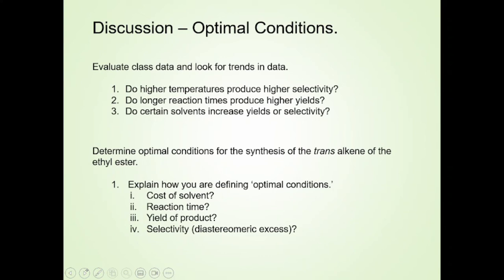about reaction times. Who had 15 minutes for a reaction time? You did. Were you in and out in 15 minutes? No. It takes time to set up, takes time to do the workup. So 15 minutes does not mean, oh, I get to do the reaction twice in the time the person doing 30 minutes does. You still have the other stuff, but it does still save time, and it can be a consideration. Yield of product, selectivity, and you may look at a couple of things.